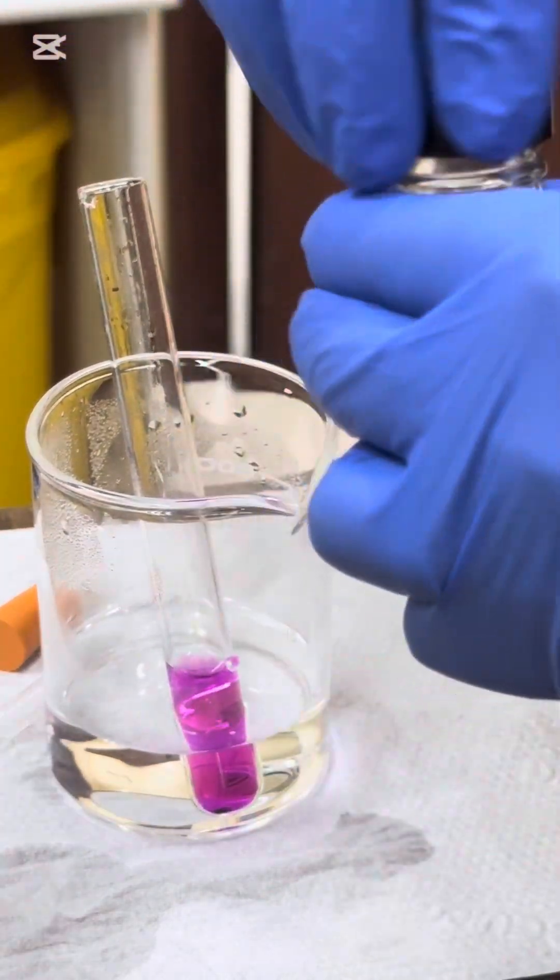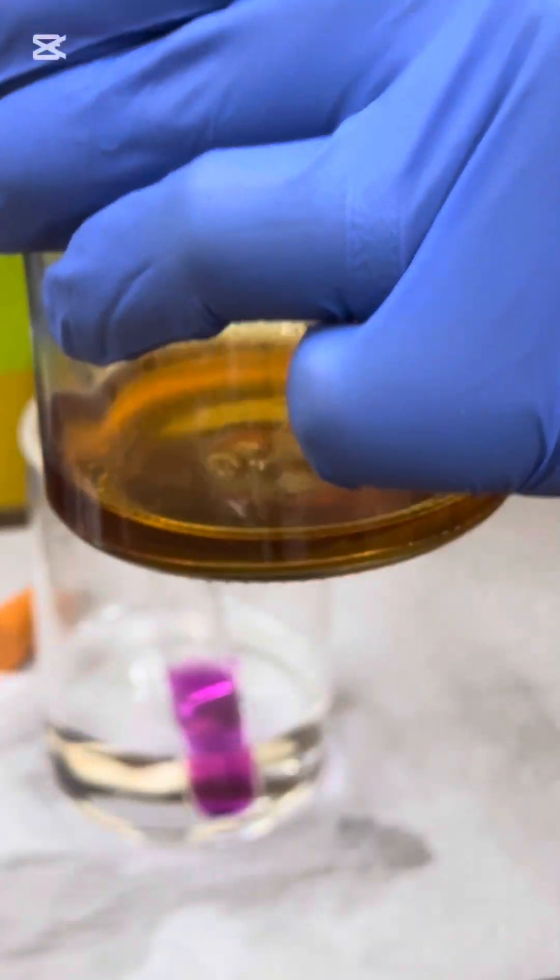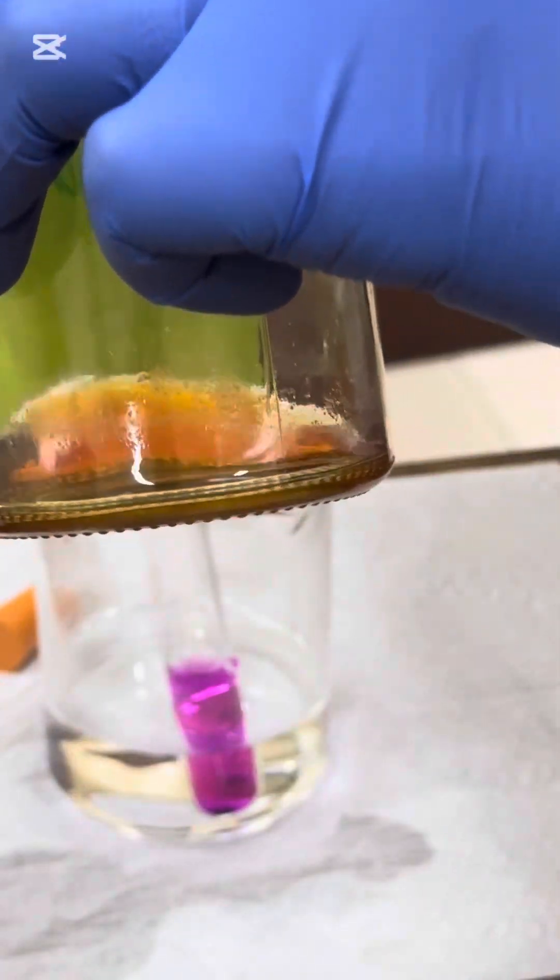Now, what I'm going to use is cyclohexene, but it looks a little bit different to the cyclohexene that you might know yourself because I've put an orange additive. This is just to show which part is the organic layer.